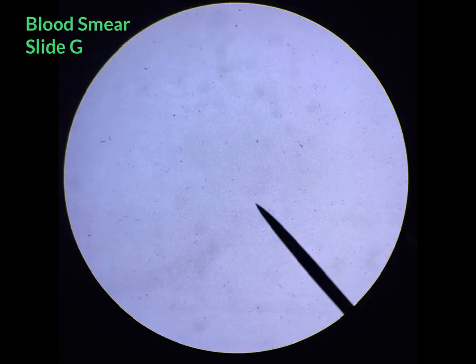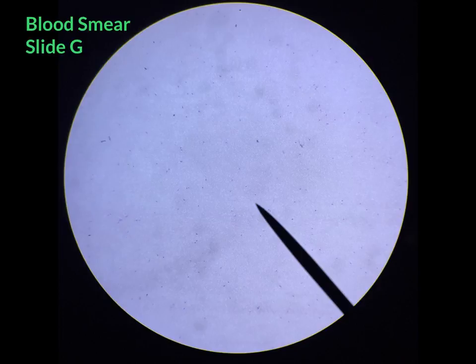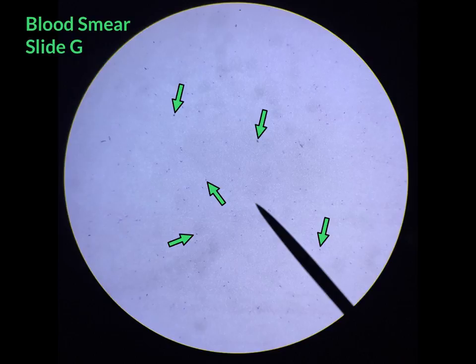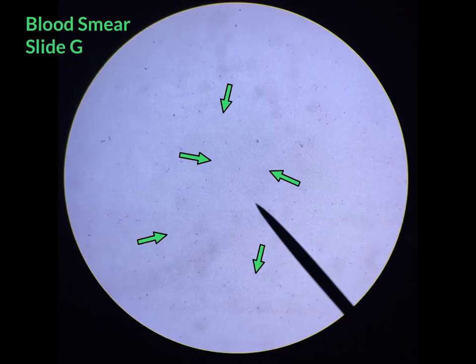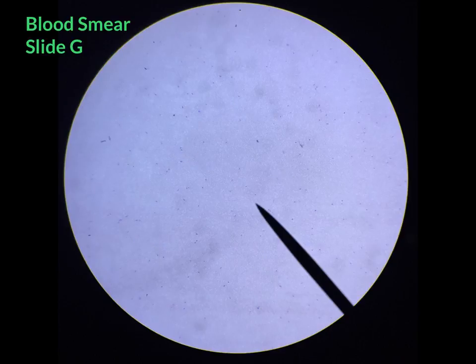Finally, the last connective tissue you have to identify is blood — the only liquid connective tissue found in the body. Although the slide may appear to have nothing on it, it does contain blood. The tiny purple dots you see are white blood cells, the faint light purple splotchiness represents red blood cells, and the ones you probably won't be able to see from this view are platelets.